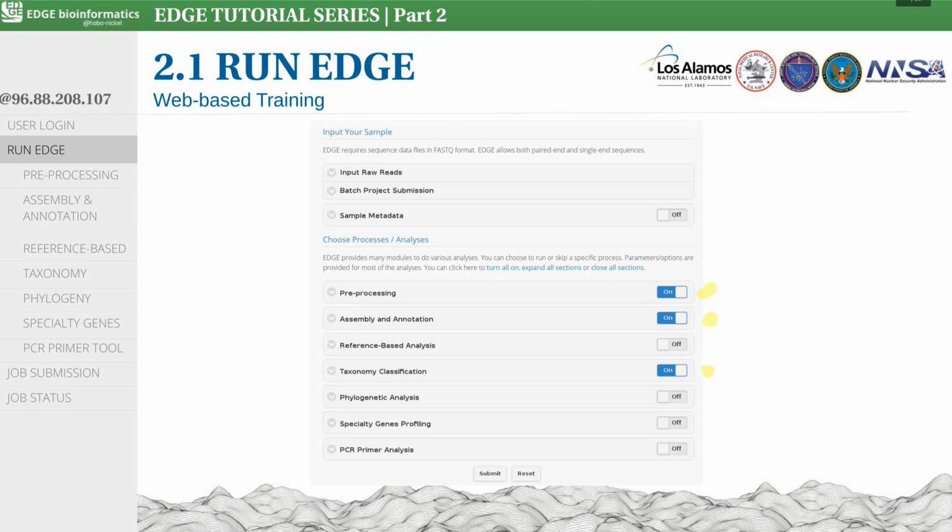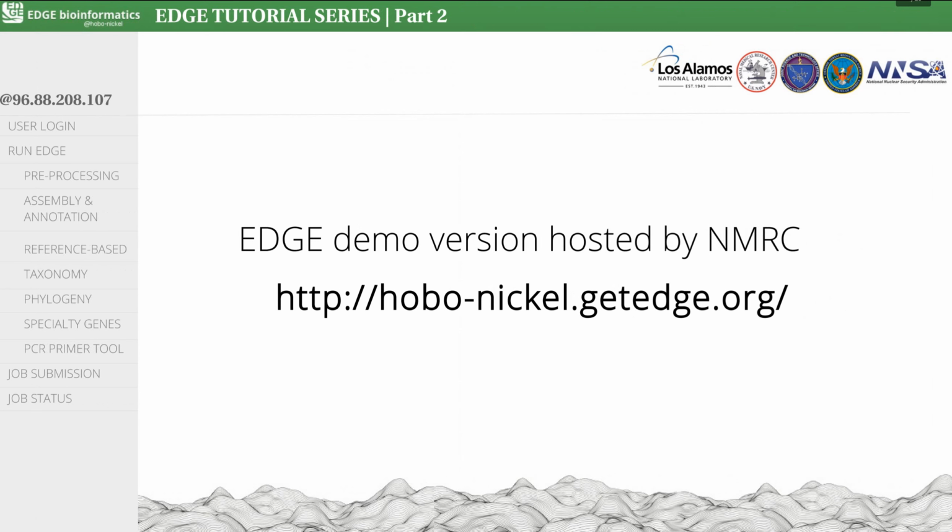Let's go ahead and switch to the live view of EDGE. Open a web browser and go to the following address. This is the outward-facing version of EDGE hosted by the Naval Medical Research Center.